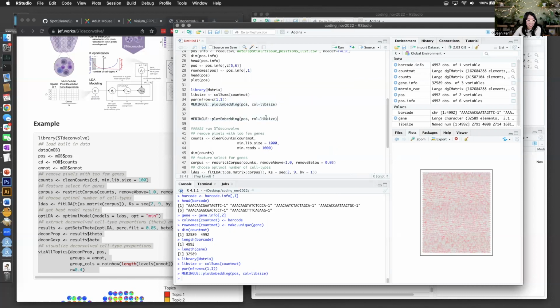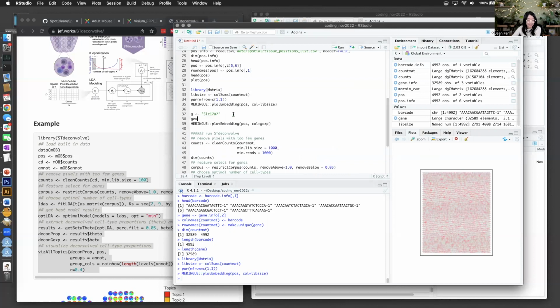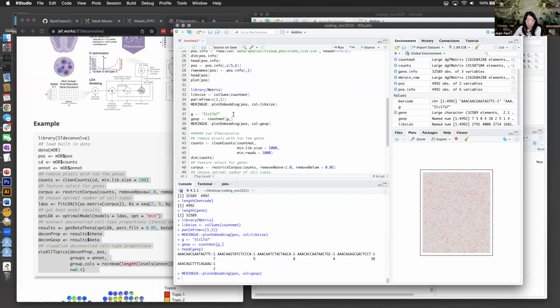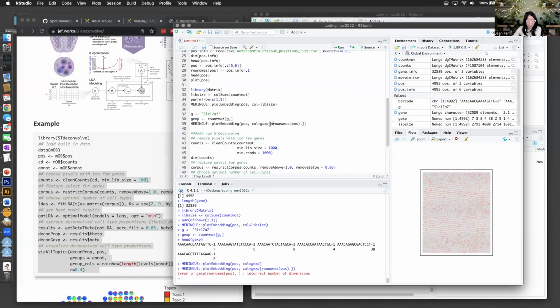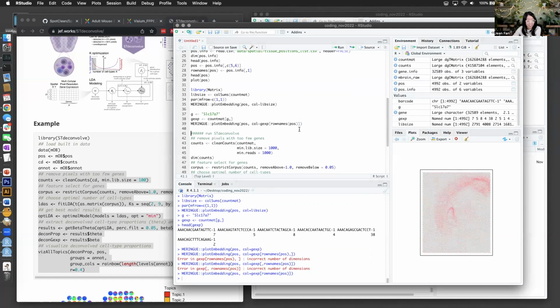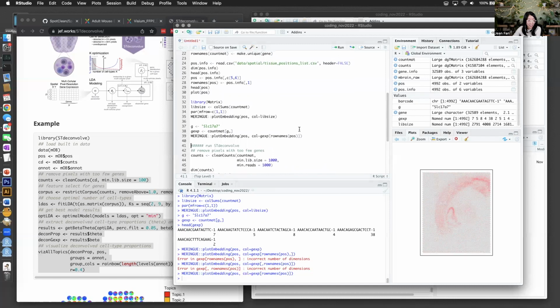Okay, maybe another sanity check. I'm going to color by the total library size. We previously saw that certain genes are very spatially defined. Just always good to sanity check. And so I'm going to look at the count matrix of this particular gene. Okay, that looks good. Oh, let's see. Okay. It's not in the same order, is it? Okay, I think I got it. Yeah, this is why we should use spatial experiments and other objects. They will do the sanity checking for us.